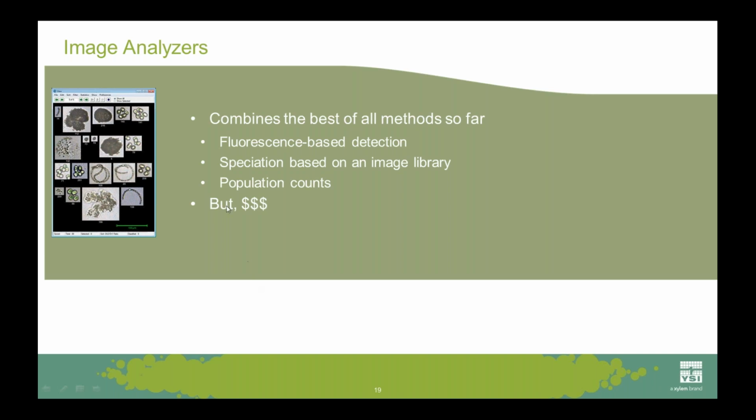Now, I changed this to say image analyzers because I recently met someone from FlowCam and I realized they don't call them online analyzers. But to me, I think this is the most exciting technology on the market today, which you might be surprised to hear since I don't sell one of these. But this is now becoming a little more mainstream, and this is a technology that really combines the best of all worlds. It pairs fluorescence-based detection with imaging of the algae. So it's like a fluorometer and a microscope in one, along with the camera.